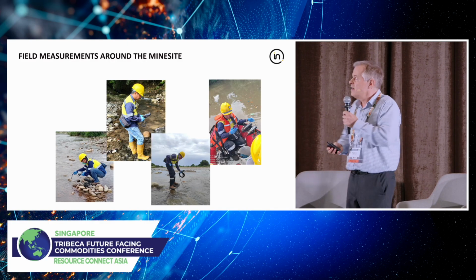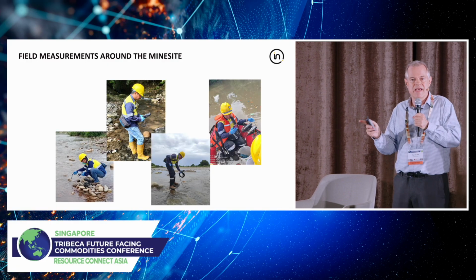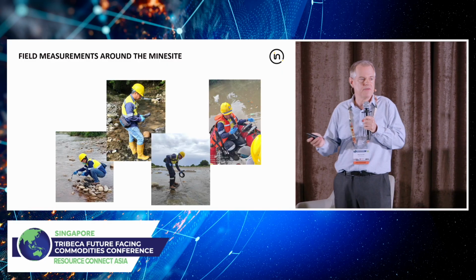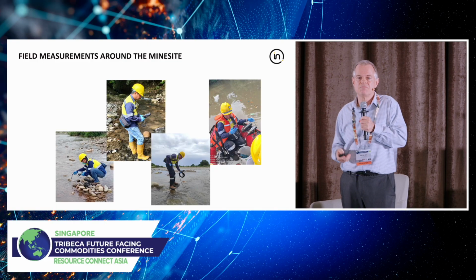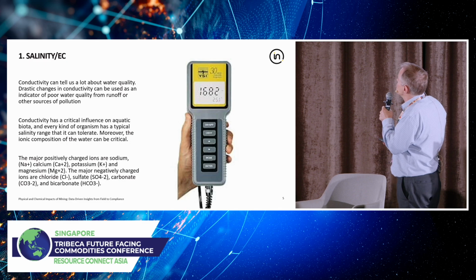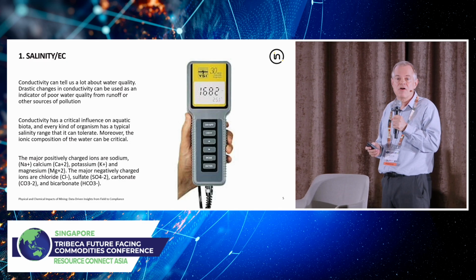Okay. So, yeah, they're holding field meters. And now, if you were to take these samples of water and send it to a laboratory, by the time the samples arrived at the lab, the readings would change. So it's very important to take these measurements directly in the field. The first measurement that is often taken is salinity, or electric conductivity.